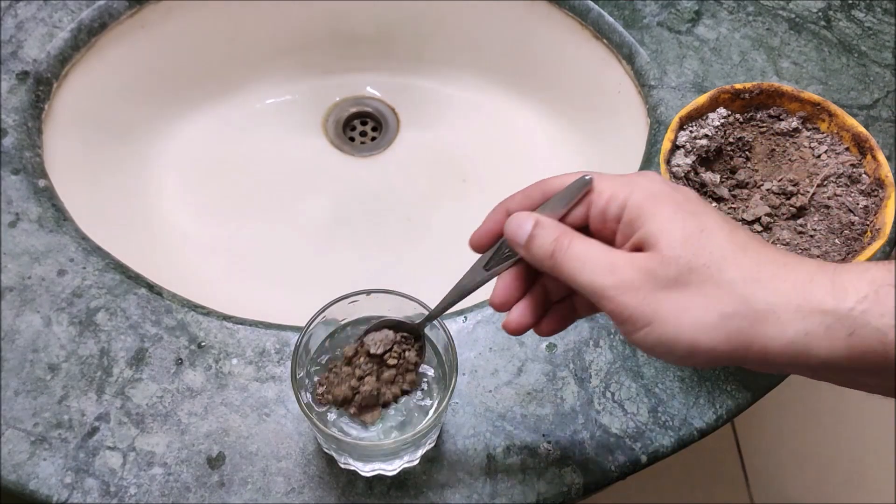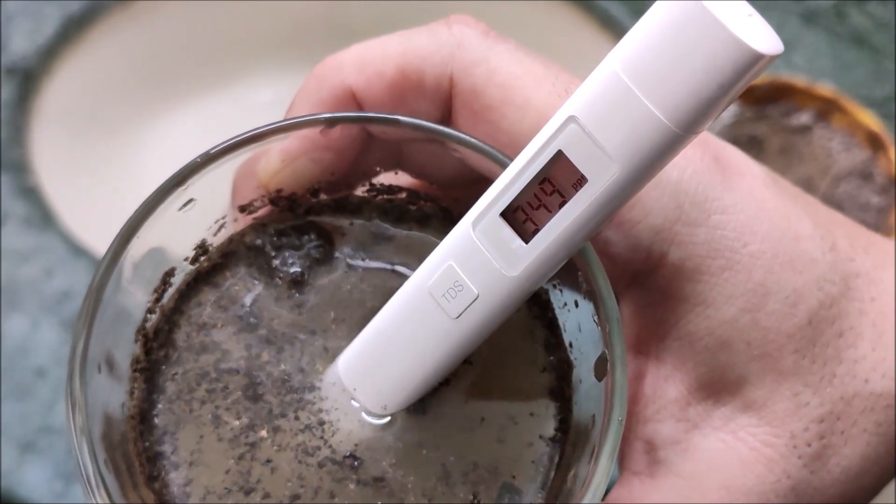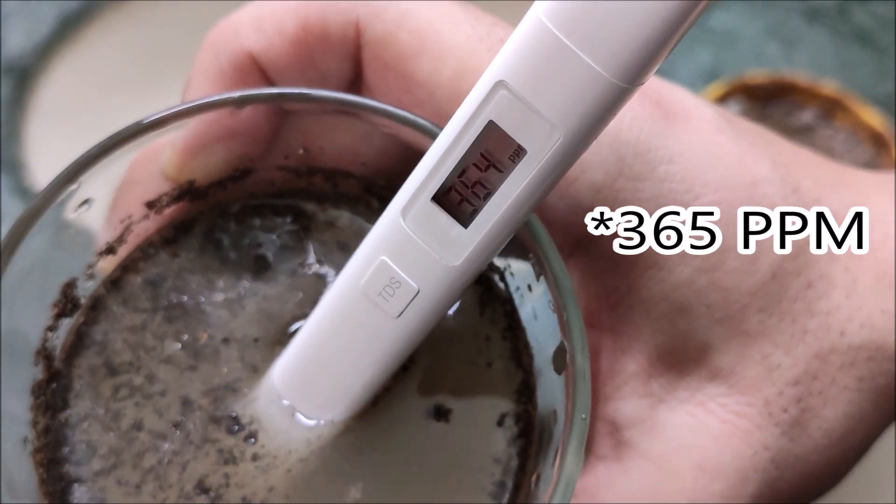Let us now check the TDS of water with soil put in it. The TDS reading of the water with soil is showing 368 ppm.